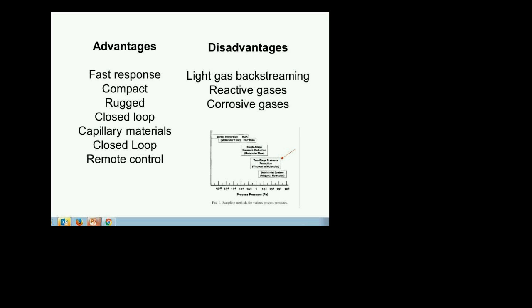So it's inappropriate in the fundamental thinking of I want my RGA to be as pristine as it can be. But the reality is your RGAs will never be pristine because you're going to use them to look at hydrocarbons anyway. So this is one of those cases where you go ahead and do it. Keep the gas concentration low. You'll probably put your sample in, heat it up, get your vapor pressure, collect your scan, and save it. And then pump it out so that it's all out of there. You go back to background spectra. That might mean baking it out or whatever it is. And then you do it again, and you keep doing it.